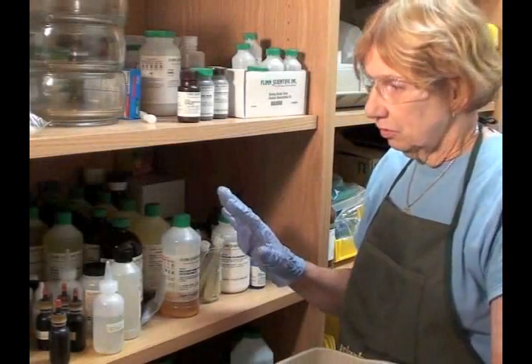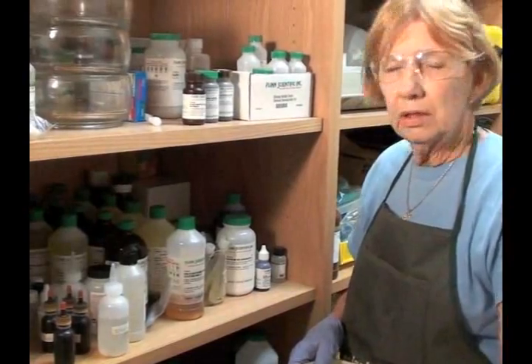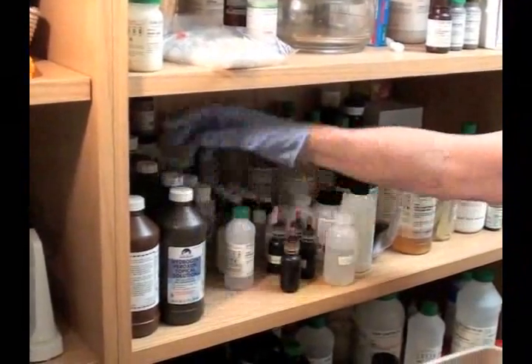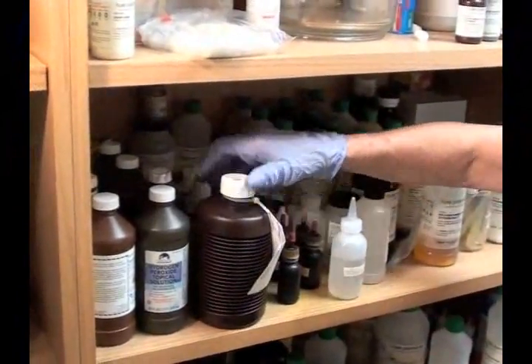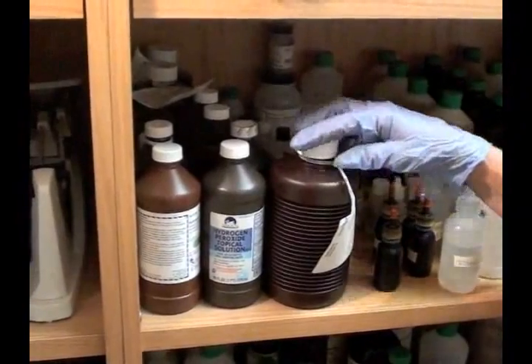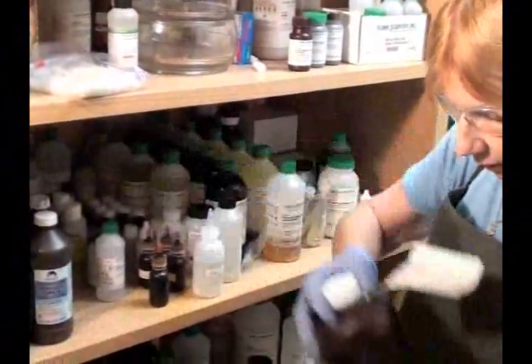I noticed when I did my initial survey of this storage room that there are a lot of oxidizers just mingled among other chemicals, and that's a rather dangerous situation. So I'm going to remove the oxidizers that are potent enough to cause problems. Here he has some hydrogen peroxide, 3%. That's not a problem. That is diluted. But he's also got some 30% hydrogen peroxide, which is a very powerful oxidizer, and it should be stored in a way that you are aware of its hazard and keep it away from any material subject to being oxidized by such a potent oxidizer. So I'm going to take these out and put them in a better place.